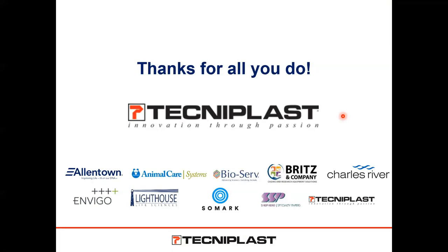You need first a special license, because it's not a transparent cage and you cannot check, you need to open every time. So you need to apply for a special protocol. But what Mike was mentioning during the presentation is that thanks to the DVC, we can monitor 24/7, and so we can detect something that is very hard to detect with only one check per day. So to reply to this, yes, you need to apply for a specific protocol.